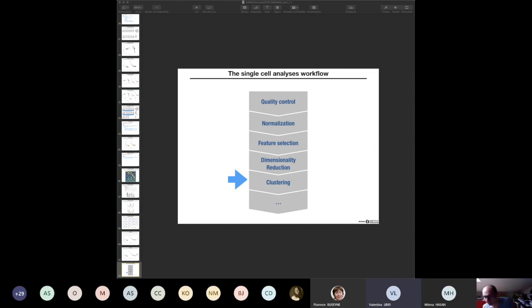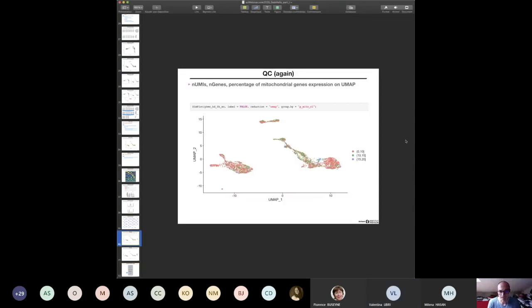Sebastien, can I ask you, if you decide to be less stringent, for example on mitochondria, where in the downstream analysis can you realize that you were not stringent enough and have to go back and change your threshold? Well, as I was saying, if you can see my screen again, in this cluster for instance, the number of mitochondrial genes is elevated.